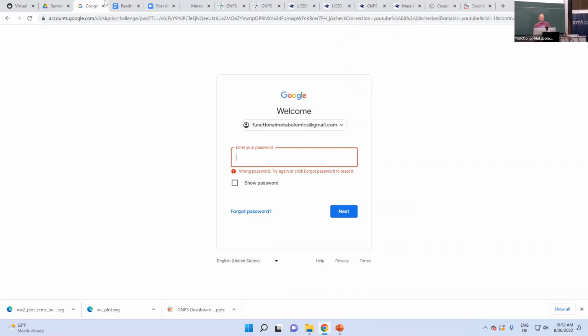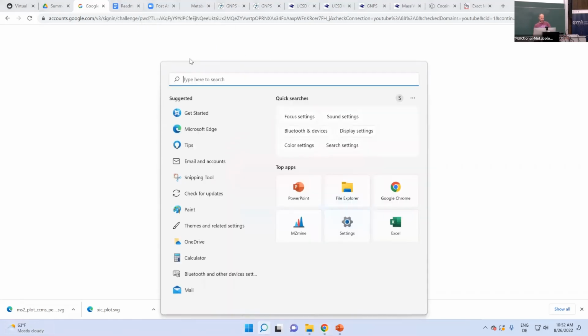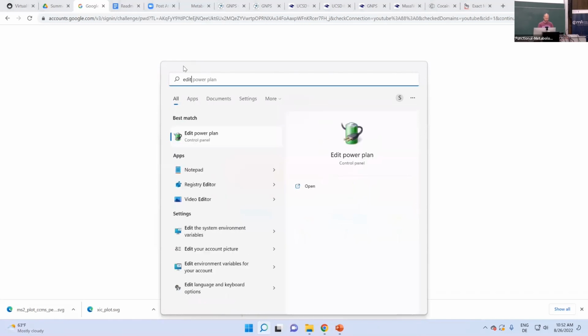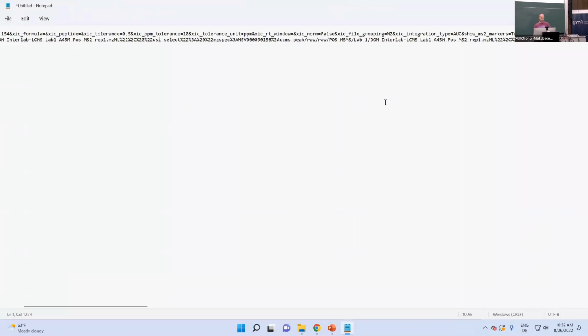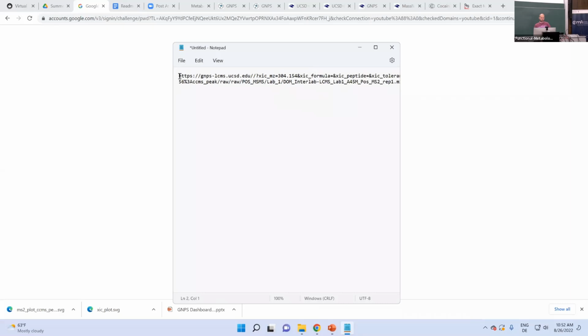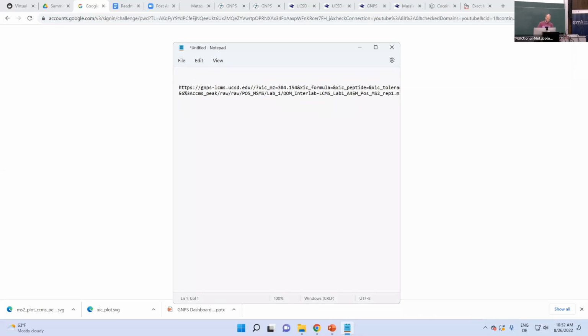Okay, I don't remember my password. Okay, anyway, so I get this long string, and I can just paste it in whatever document. If that would be the editor here, I paste it here, and then that could be the SI, and I organize this in a table and say here, I don't know, dashboard link, lab 1. So in that way, everybody can reproduce what I did.